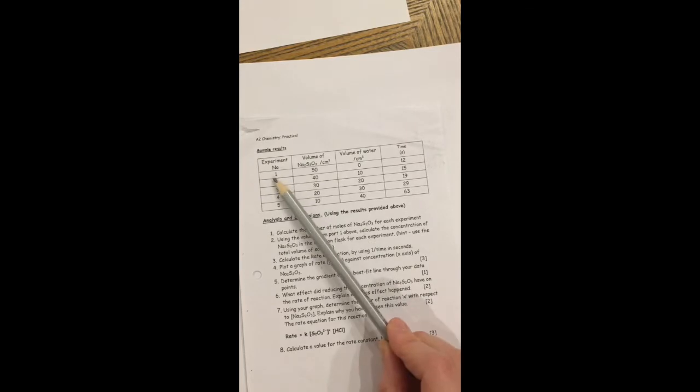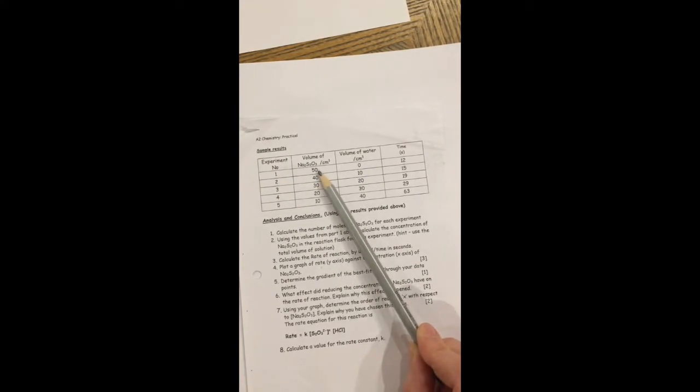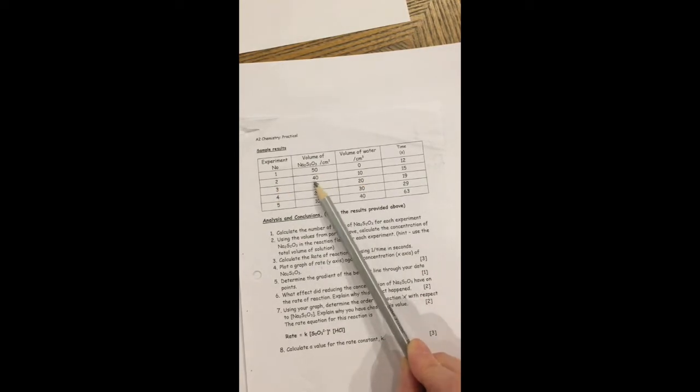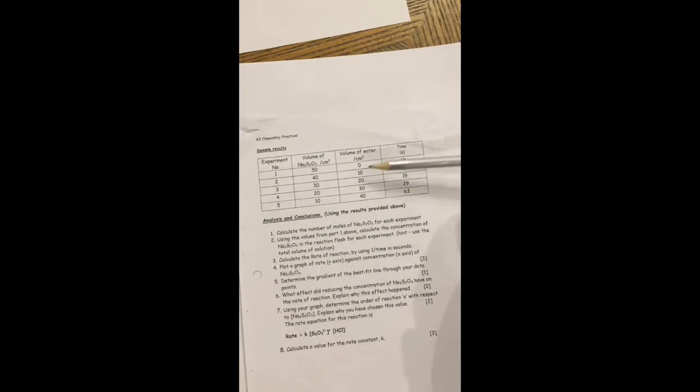So here for experiment 1, we didn't dilute it at all, it was just the thiosulfate, but experiment 2, we diluted it. It was a 40:10 ratio. Here 30:20, 4 here was 20:30, and 5 was 10:40. So we're getting increasingly less concentrated.